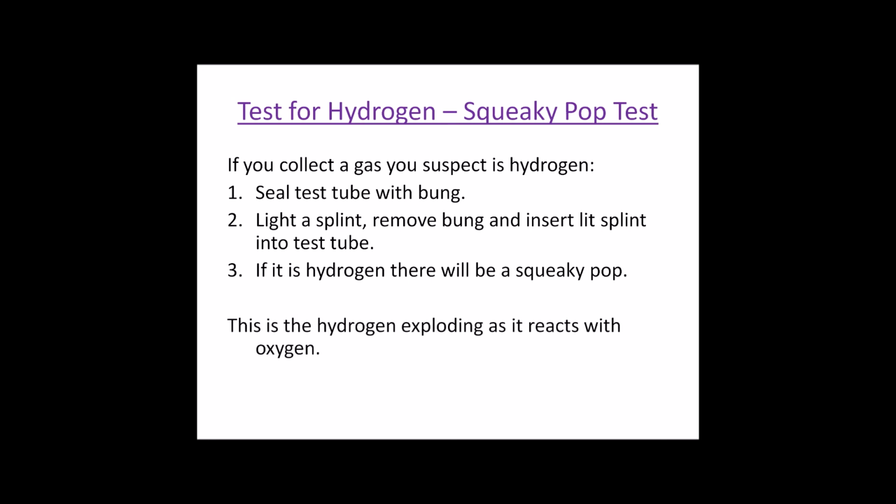What's happening there is the hydrogen is reacting with the oxygen, and the reaction is explosive. The water vapor that's being produced is very, very hot, and it causes the gases inside the test tube to expand and rush out, and it makes that whooping noise, or the squeaky pop. You may also notice, if you watch really carefully, a flame shooting out of the end, but don't worry, you won't burn yourself.